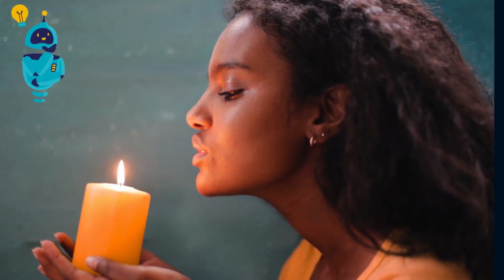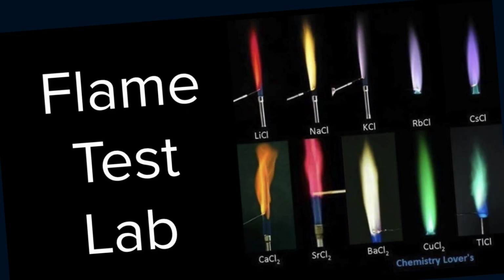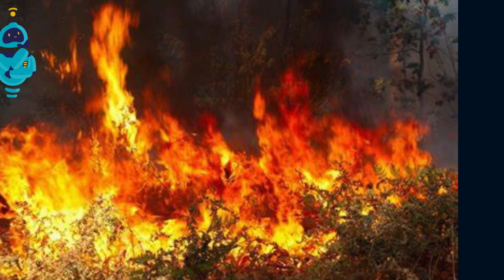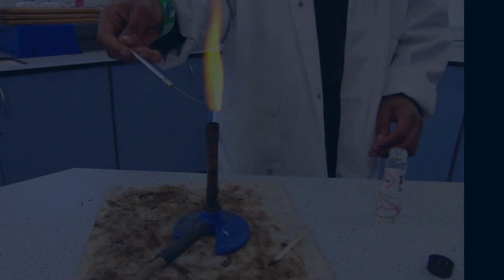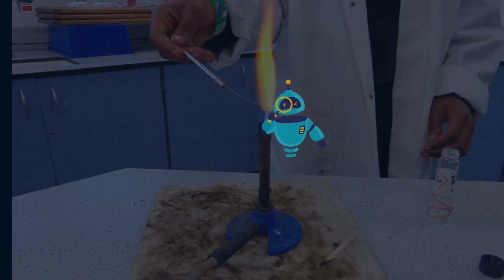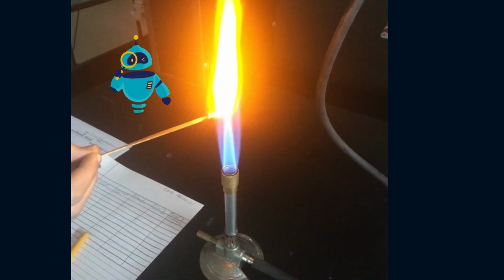Did you know that the flame's color might hold clues about cadmium? It's not just a lab experiment, it's a potential revelation in your everyday surroundings. When heated in a flame, and reacted with hydrogen sulfide gas, cadmium produces a characteristic yellow color. The formation of this yellow coloration is indicative of the presence of cadmium ions.